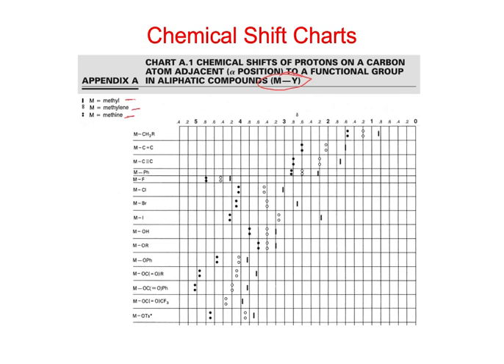If it's just attached to an alkyl group, then these are just the signals for an alkane, essentially. The bar is a methyl, the two circles are a methylene, and the two dots are a methine. So what we see is in all of these, it always goes methyl is more upfield, then methylene, then methine, right? Just a substitution difference here.